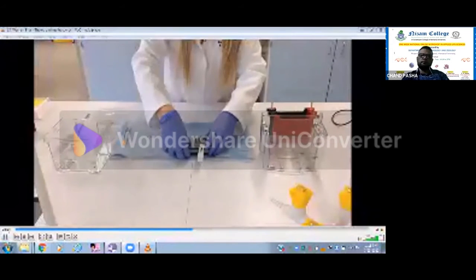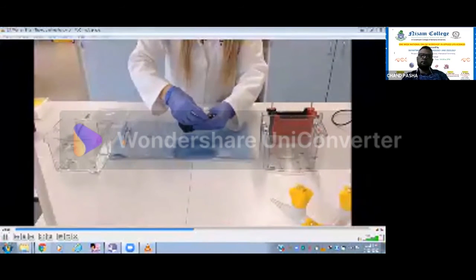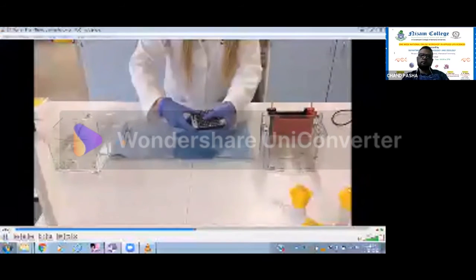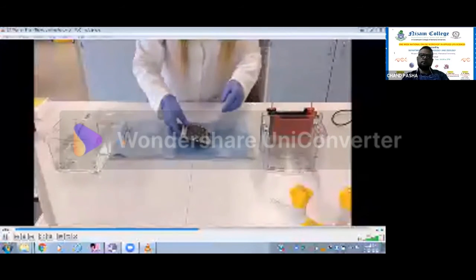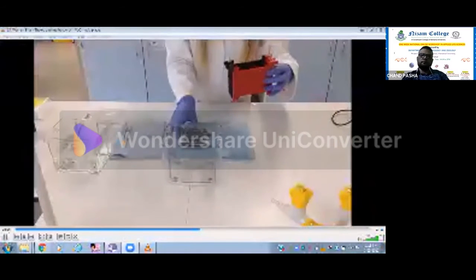You can then close the blotting module, squeezing it to remove any excess fluid and ensuring that there is proper contact between the polyacrylamide gel and the nitrocellulose membrane. To seal the module, you then pull the white bridge over and clip it into place. You are then ready to begin the transfer.